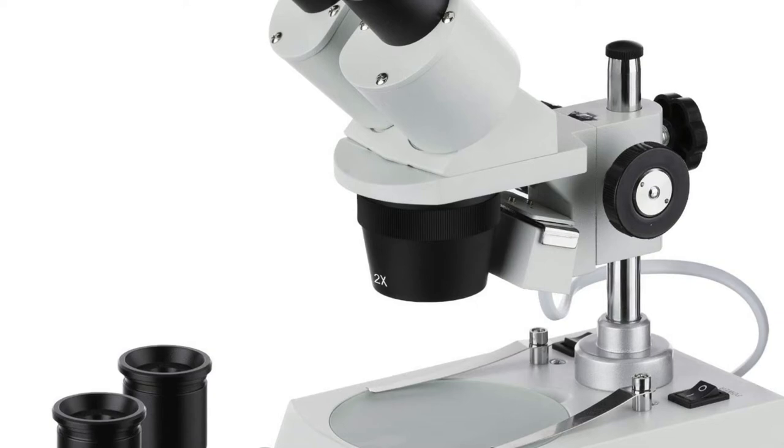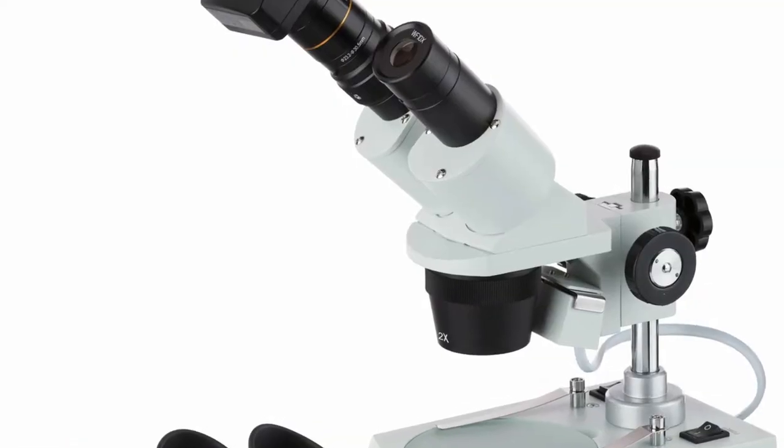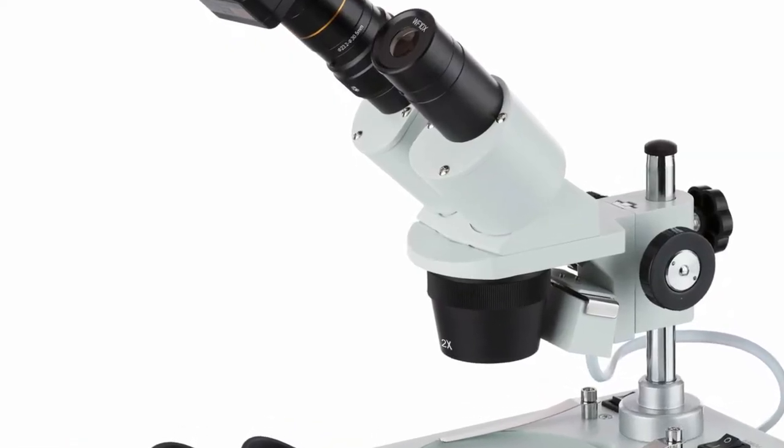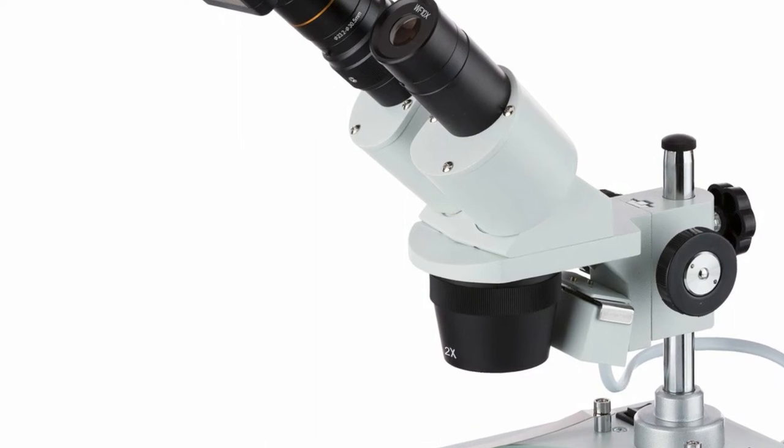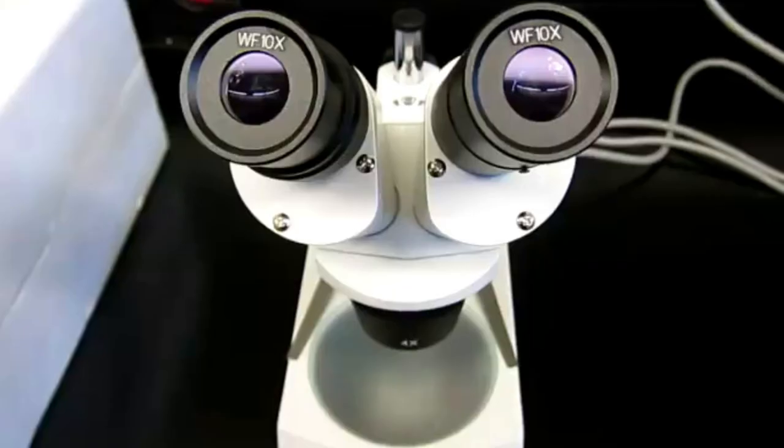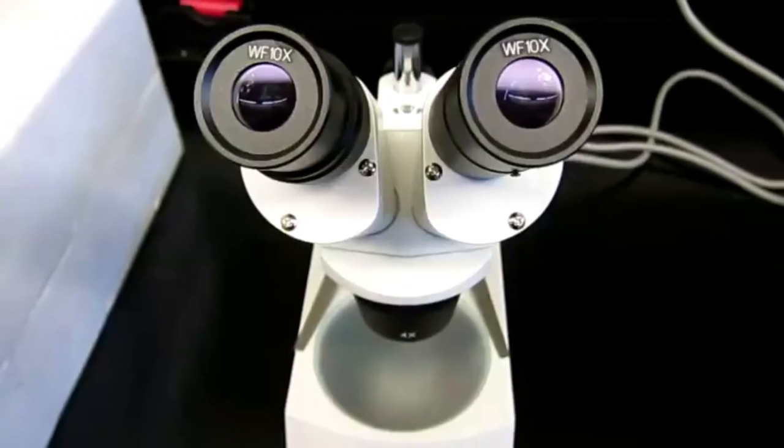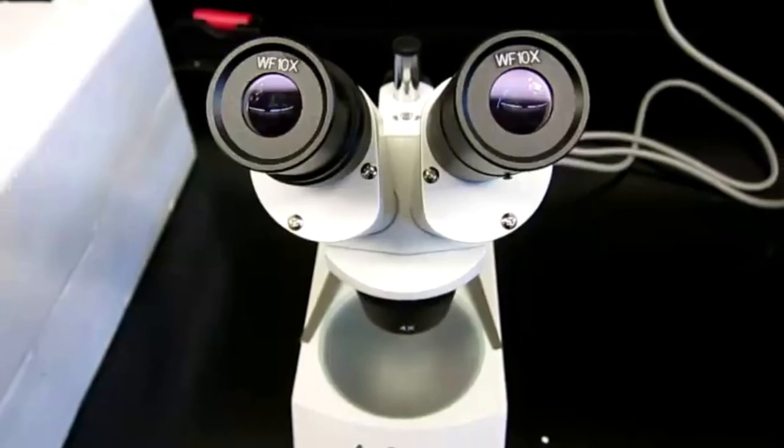This is an important aspect of the microscope given that it will allow the user to view the fine details of the specimen under observation and effectively manipulate handle parts. This makes it particularly ideal for watchmakers, jewelers, as well as philatelists among others.